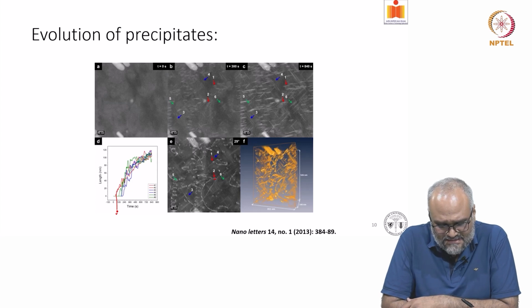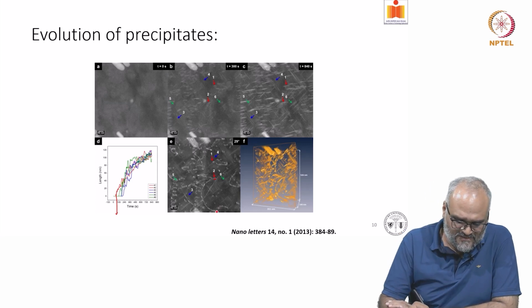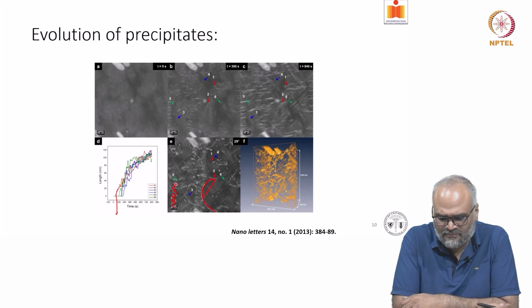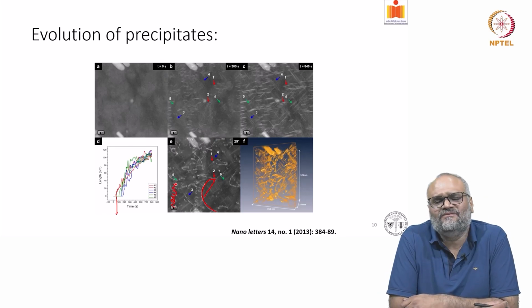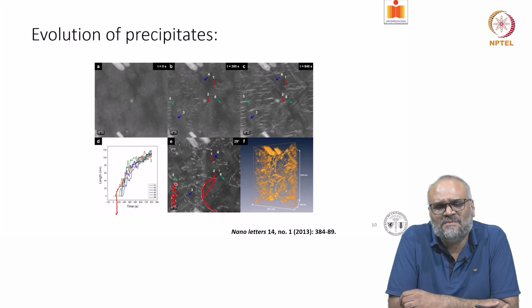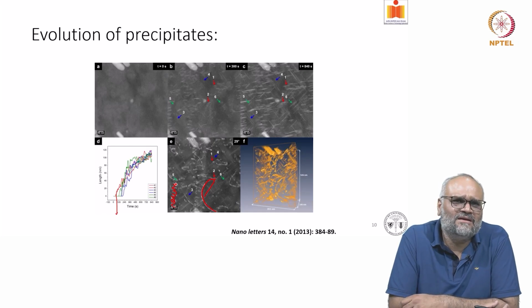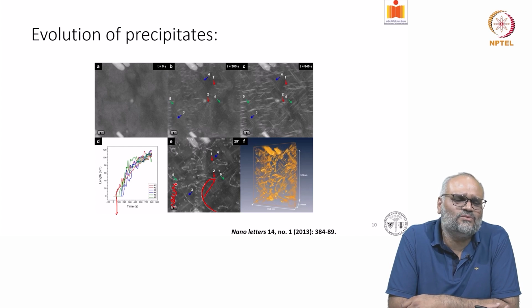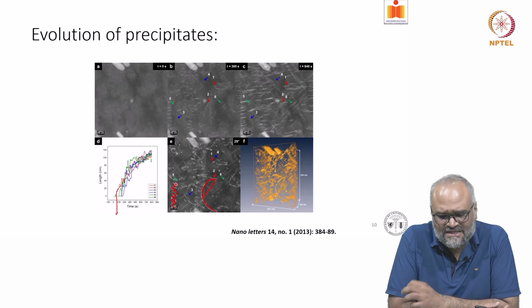The reason is, if you notice here, the precipitates are connected by something which appears like this, and over here also you have these kinds of features. So within a face-centered cubic metallic material like aluminum, there is usually a large number of dislocations, and with high dislocation densities, these interfaces act as regions where precipitation is favored.